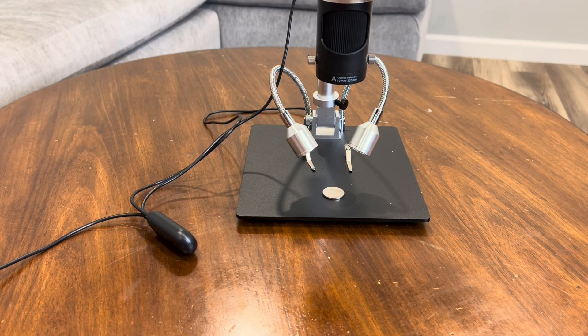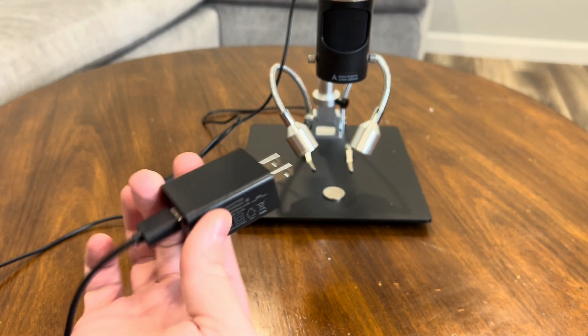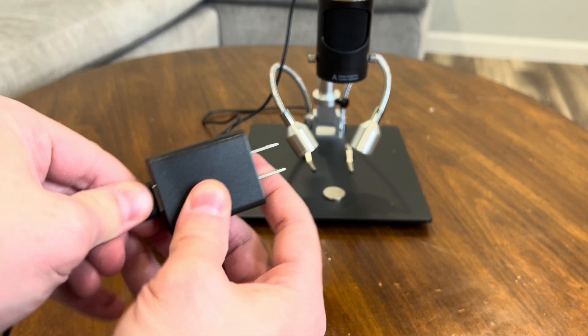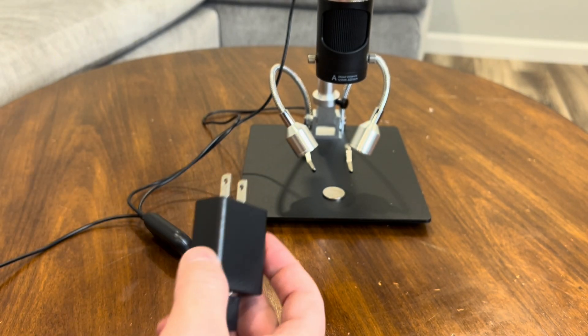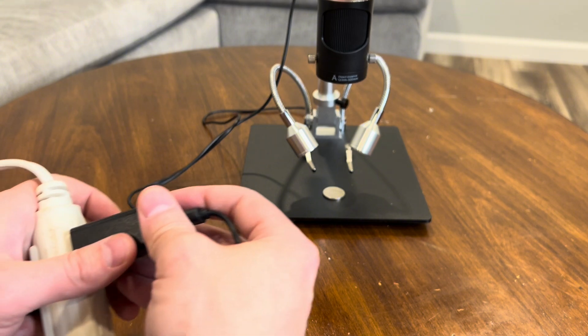The only con I have is that there's no battery option. The microscope needs to be plugged in at all times — there's no built-in battery, so you'll need access to a power source whenever you want to use it. This limits portability and could be a drawback for those who need a more mobile solution.